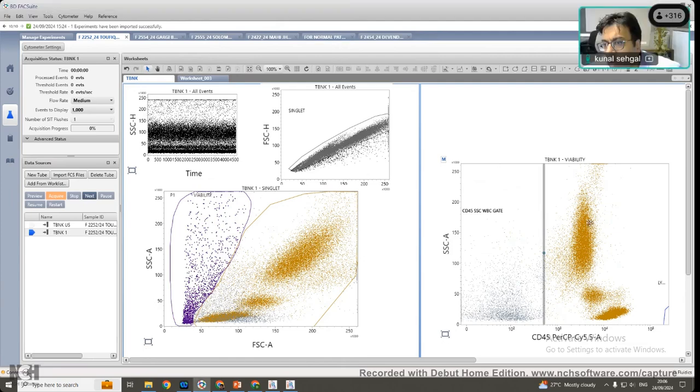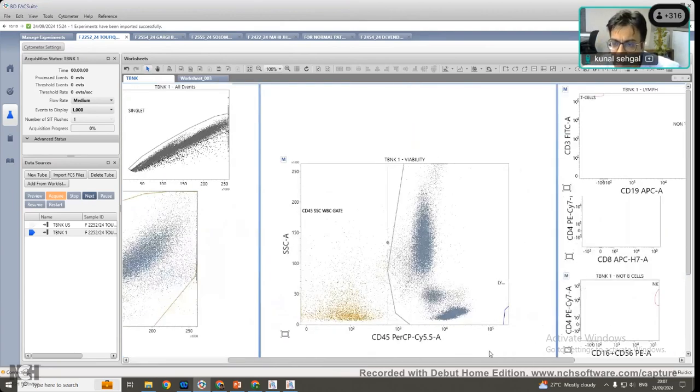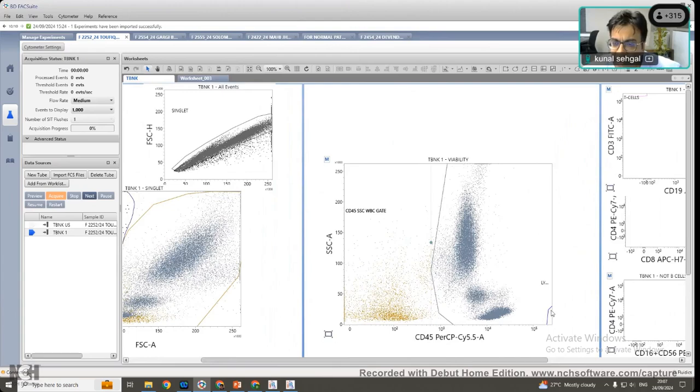So if I give gray color to WBCs, what I have done is, ahead of this value, anything which is positive, WBCs, I have given a gray color. Now we are studying lymphocyte subsets. As Avinash was telling you, the property of lymphocytes is that they have the lowest side scatter. So I want to give blue color to lymphocytes. I've already pre-prepared a gate.